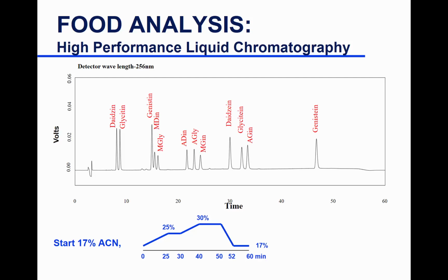The water or the acetonitrile? Yes, acetonitrile. So you increase the acetonitrile concentration after 35 minutes to even higher than 30. You can just bump it up to 40 and keep going up. Don't stabilize. Between 40 to 50, you don't have to stabilize. You can keep increasing higher, yes.